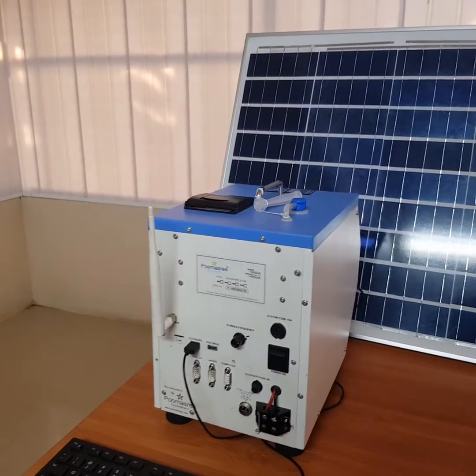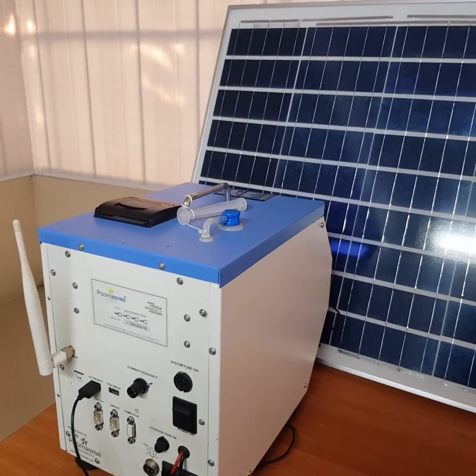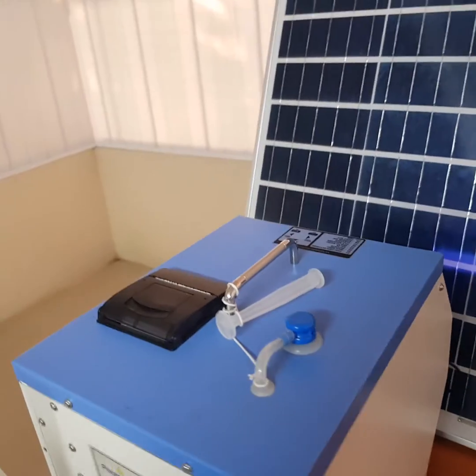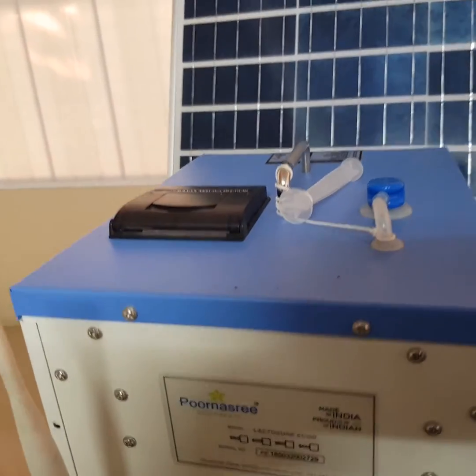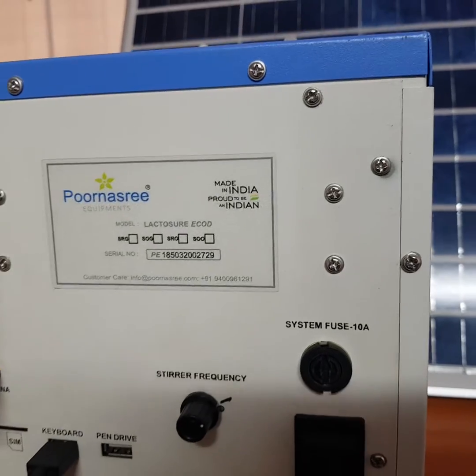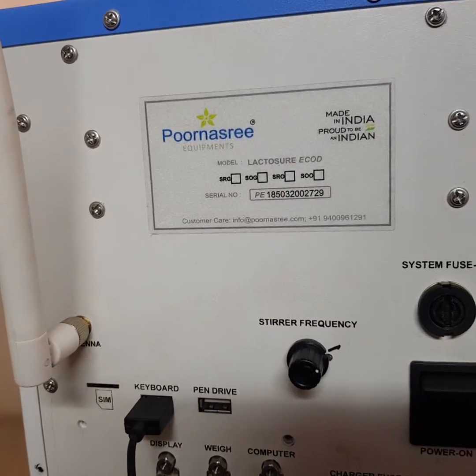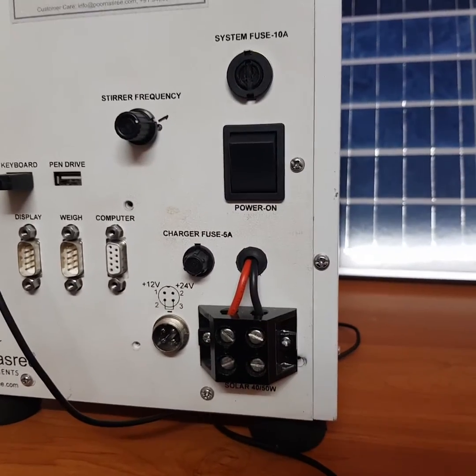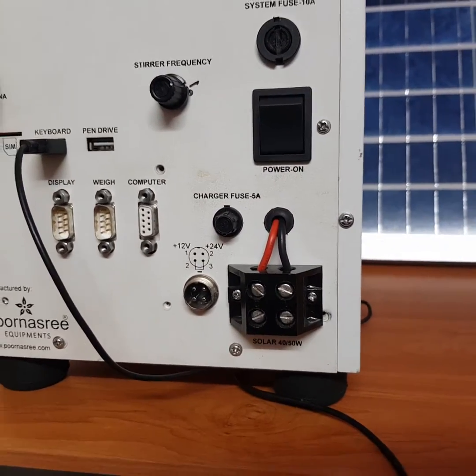The built-in LFP battery has two battery models available. The 6Ah battery gives 3 hours of backup and the 12Ah battery gives 6 hours of backup. The analyzer comes with an external 50W solar panel and it can charge the battery to full on a sunny day.